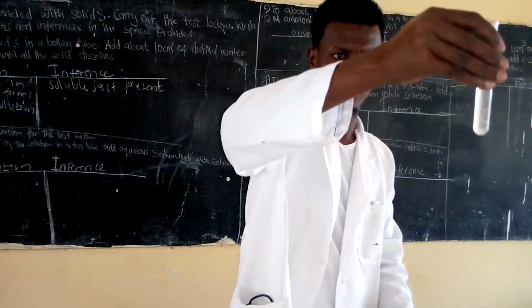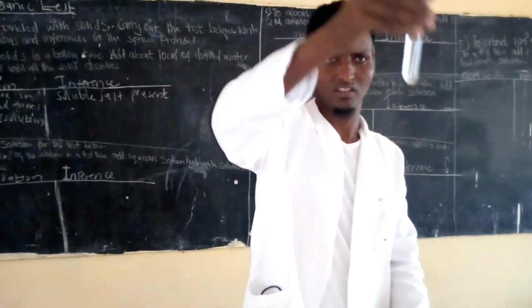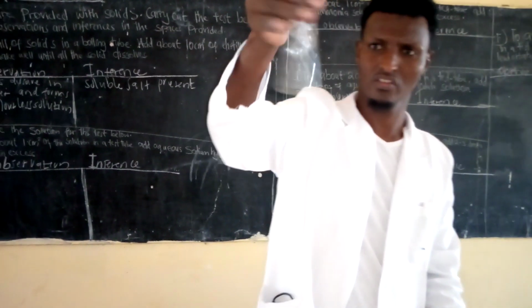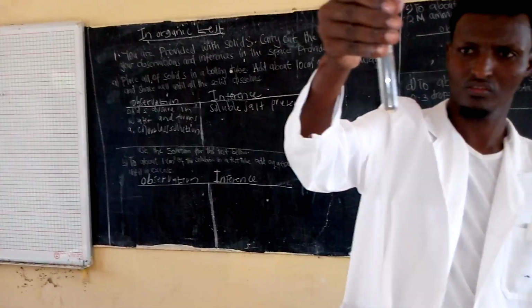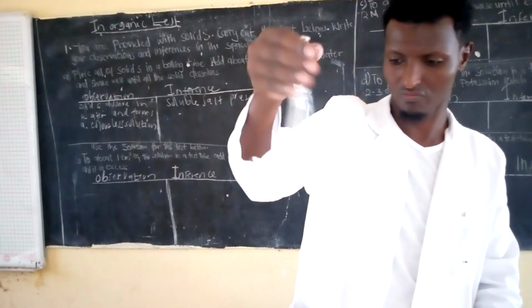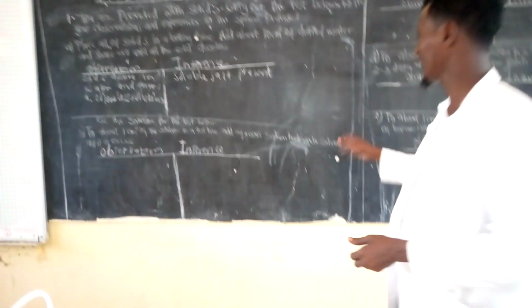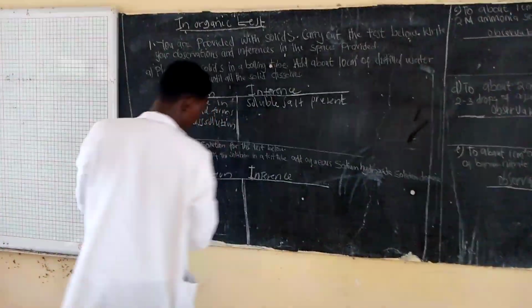In excess, the solid is going to dissolve now. I see now, the white solid is going to dissolve. Yeah, in excess. So what form?